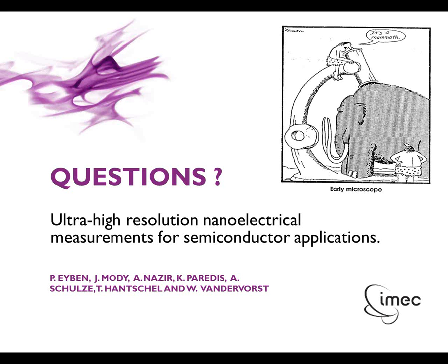A number of questions are coming in on solar cells. There's one here on a customer who's measuring P3HT ICBA solar cells, wants to measure photocurrent, and has an issue with moving the material around during the measurements when doing either conductive AFM or TUNA using SCM-PIT type tips. Any advice on that?